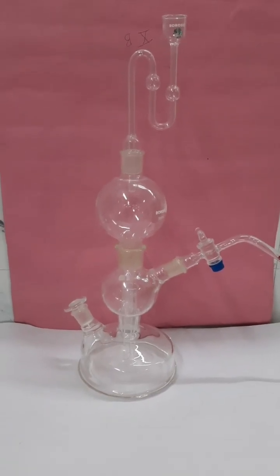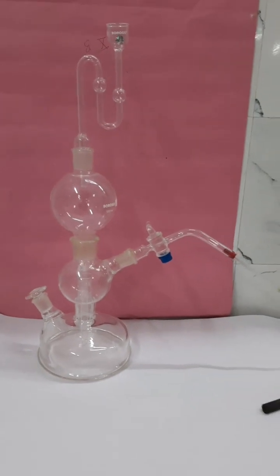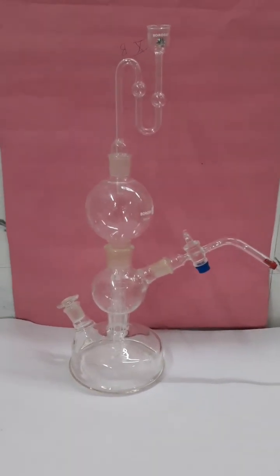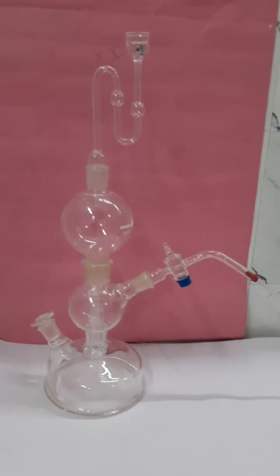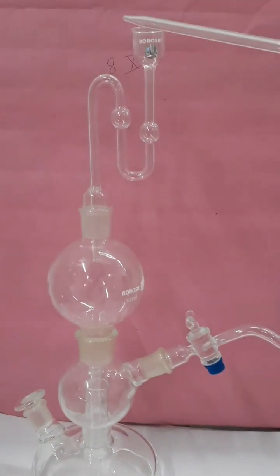This is a Kipp's apparatus used for preparation of different gases in laboratories. This apparatus was invented by Dutch pharmacist Petrus Jacobus Kipp. This apparatus contains three chambers stacked vertically over each other. The first chamber extends in the form of a long tube that passes through the middle chamber and enters into the third chamber.